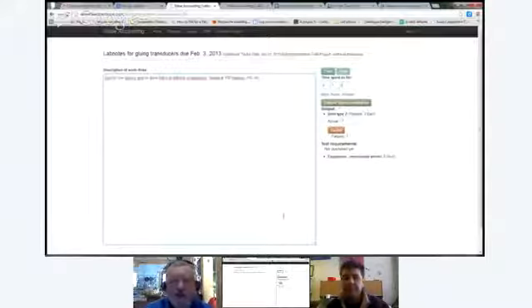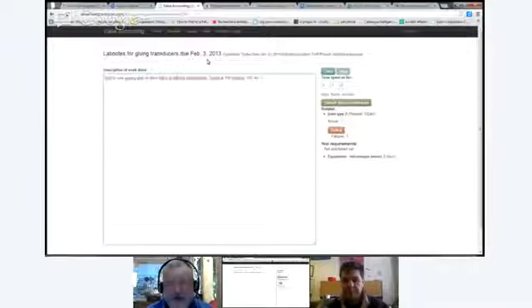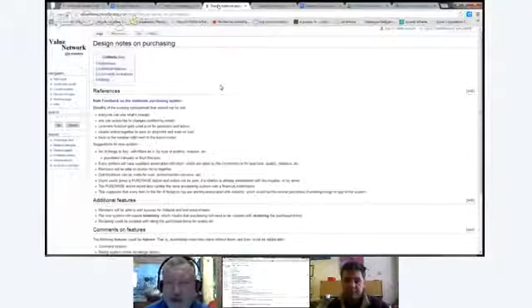So right now you can have multiple pages out yourself. You can do all this kind of stuff. If both you and Francois were working on the system at the same time, then you will occasionally hit some performance problems. You'll be interfering with each other because the database doesn't do that very well. But it's probably okay. And by the end of the week, I'll have you into the industrial strength database.